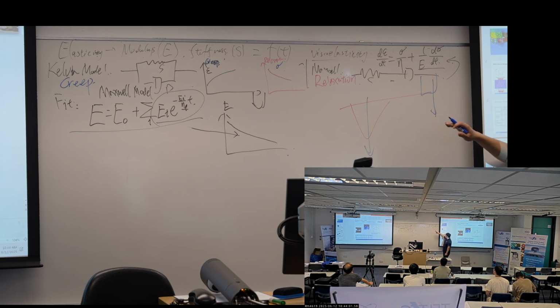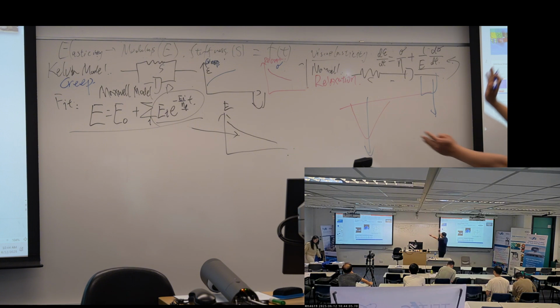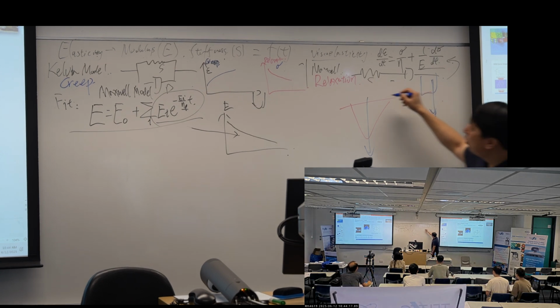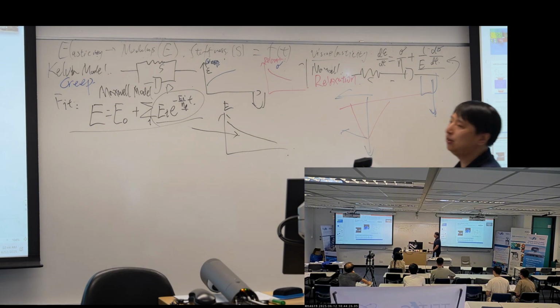As such, we push the probe down. And since it is a cantilever connection, we apply force here. On the left side, you know the beam, or you know the basic force, it will cause a shear force in this direction. And this shear force direction will push the probe in this way.